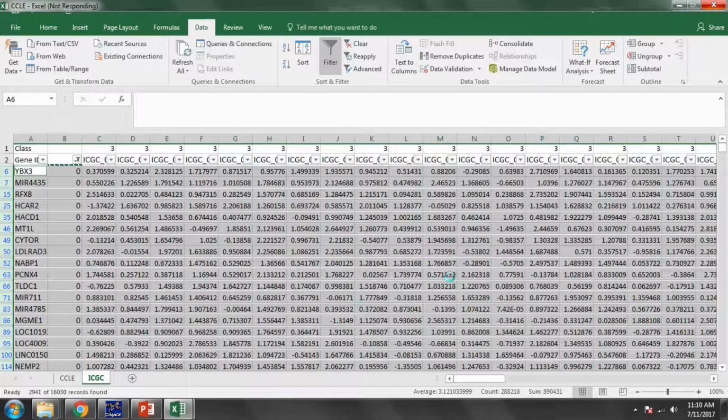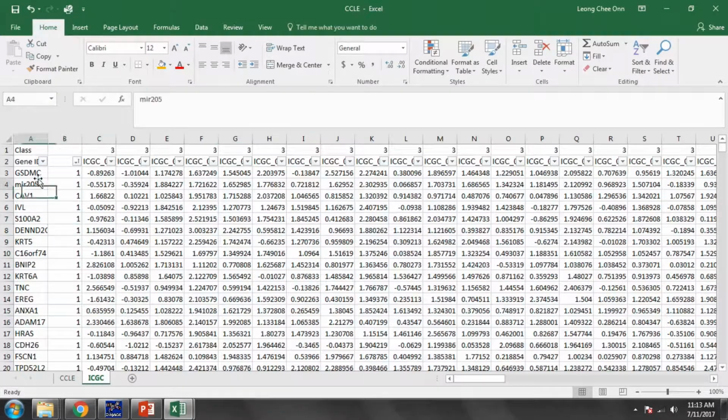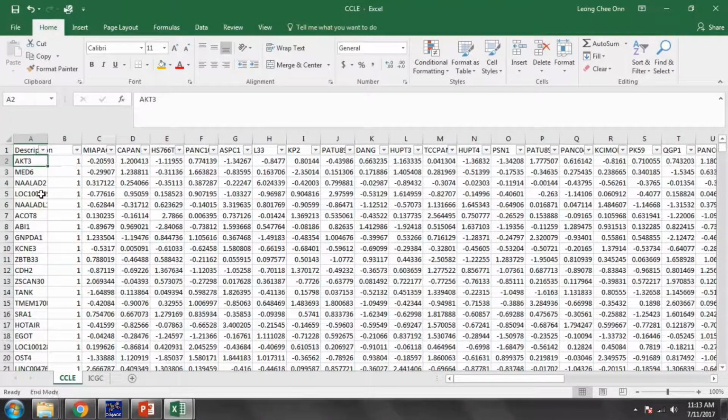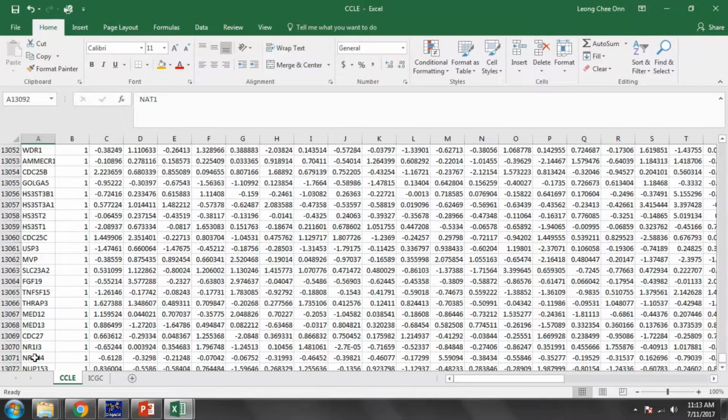So basically what we are trying to do here is just the harmonization step, to make sure that the two datasets match with each other. Okay, so now you should have two datasets that match with each other. Just to check, you have about 13,091 entries here, so this should have the same number. Okay, 13,092.